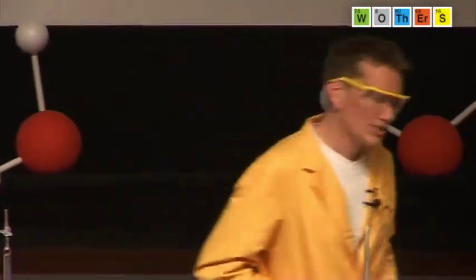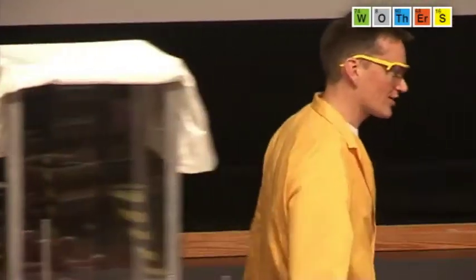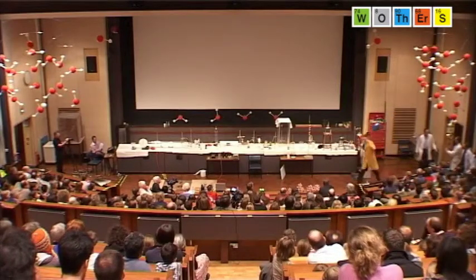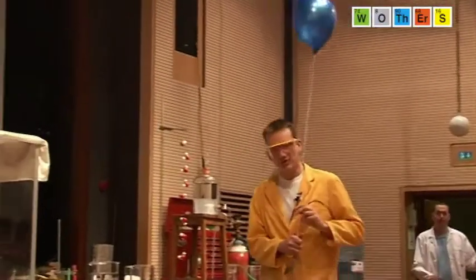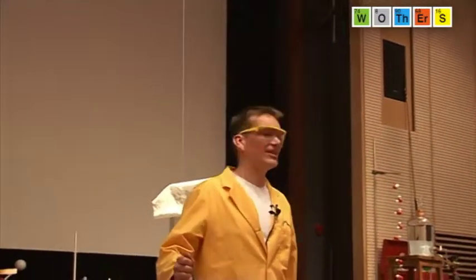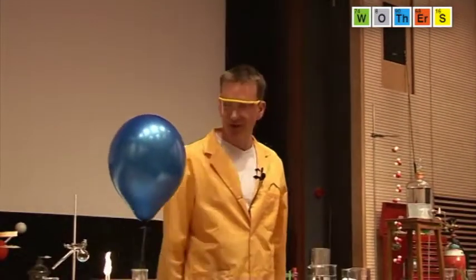So now we're going to have a look at these gases and see the properties of these. So first of all, we'll start with the gas hydrogen. Okay, so here is a balloon full of hydrogen, and of course we notice one of the properties of this gas, and that is it's much lighter than air. In fact, hydrogen is the lightest substance in the universe.